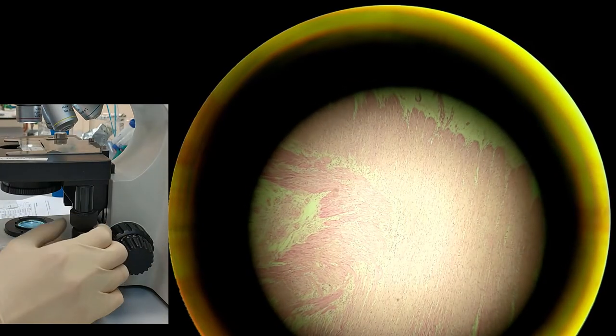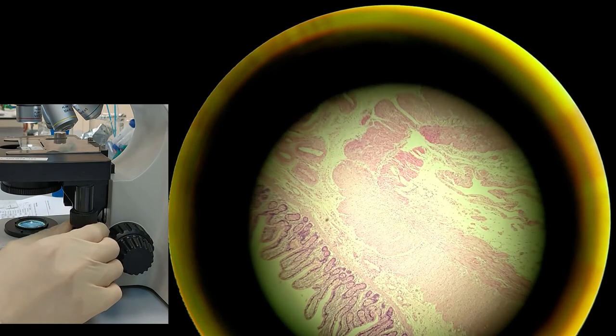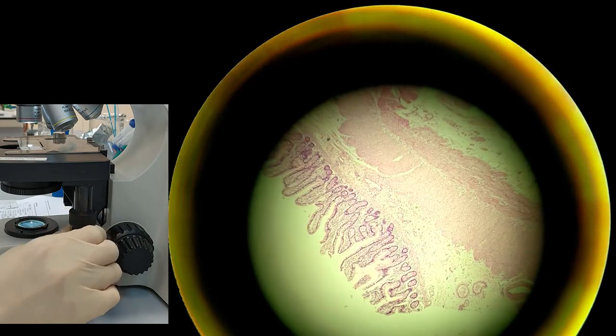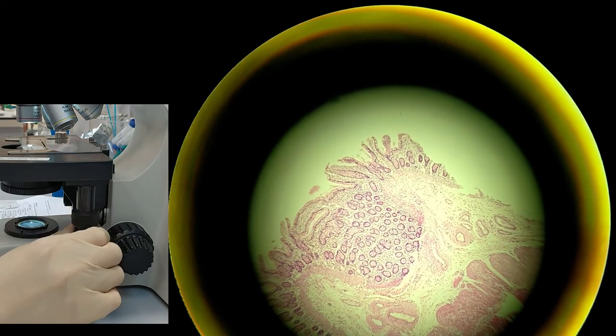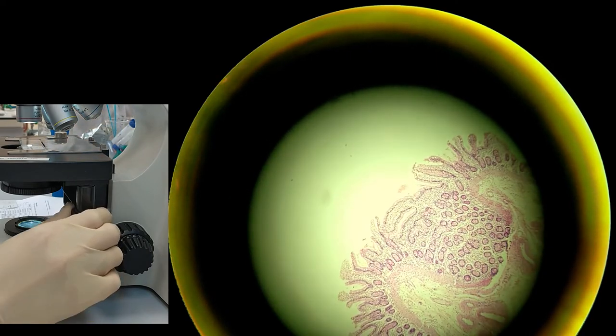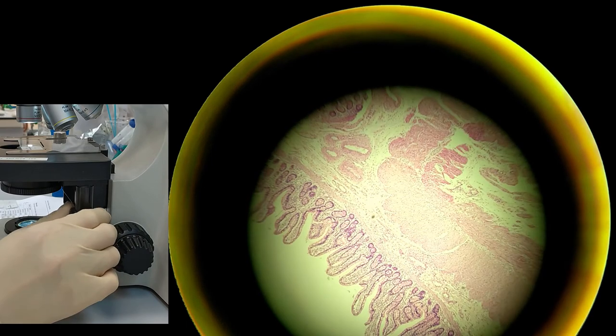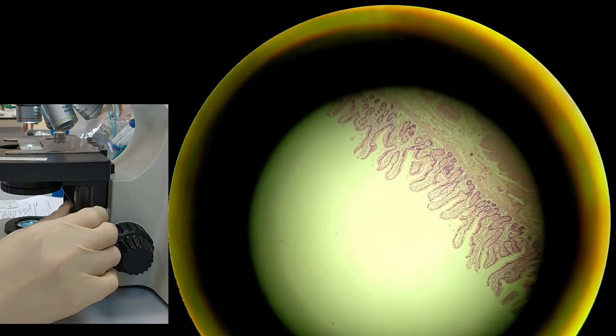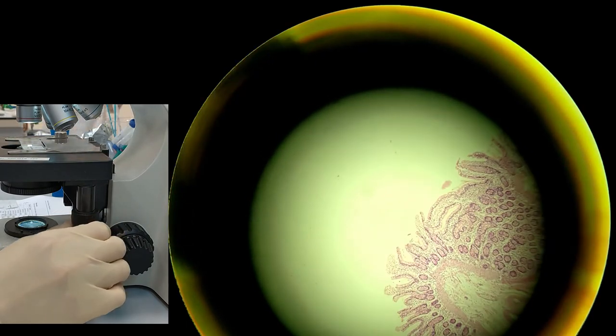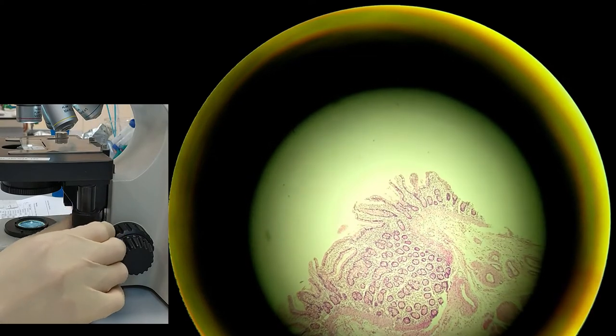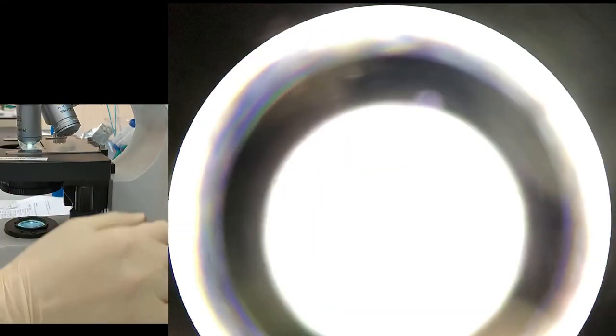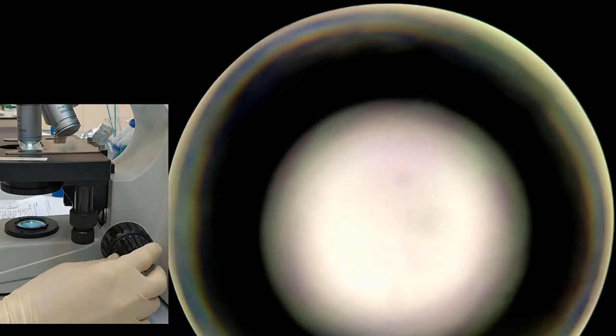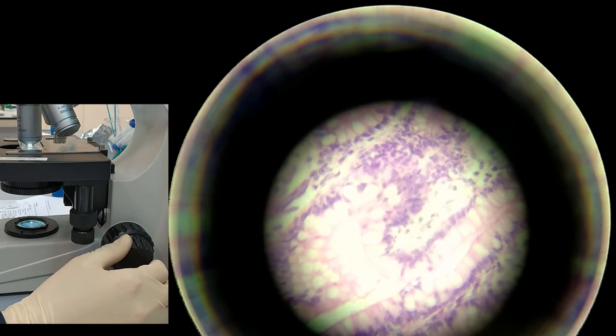Here you can see the intestines, small intestines of the human. As you can see, we have this villi that show the surface of the absorption in intestines. We can increase the magnification to see this trabecula.